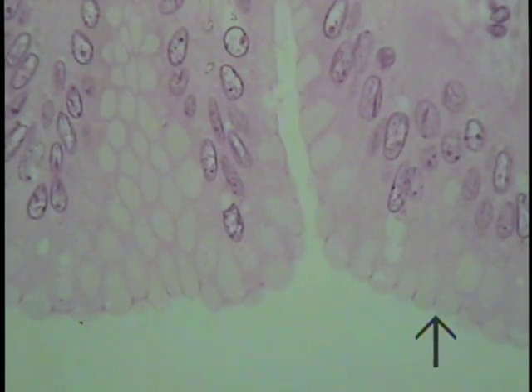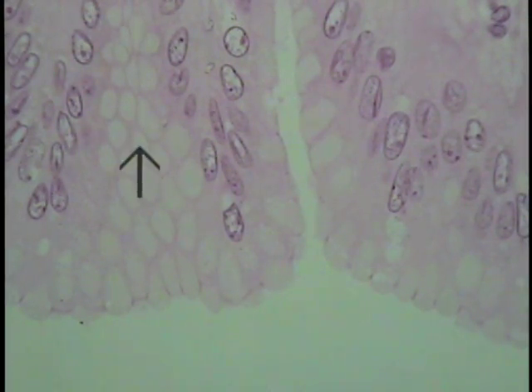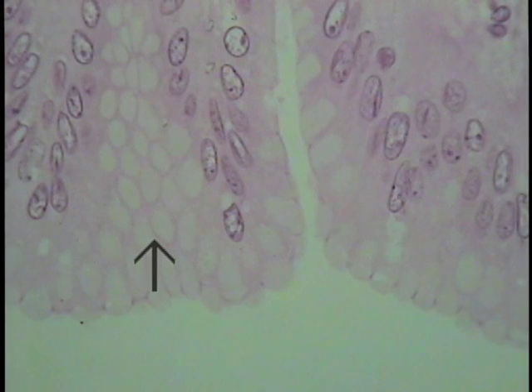So you've cut through here, flipped it up 90 degrees, and you're looking directly down into the interior of the mucin granules within these cells. This is due to the folding and curvature of these tissues, and it's a problem that you'll simply have to deal with in developing a three-dimensional image in your own mind when you look at enough of these particular sections.